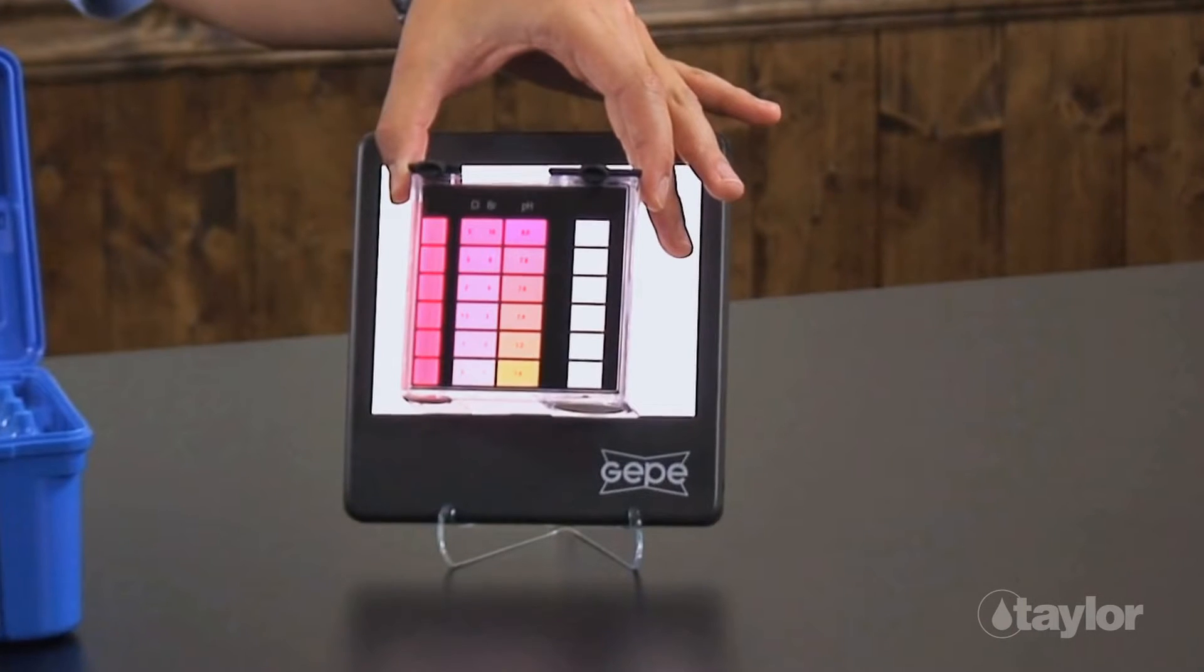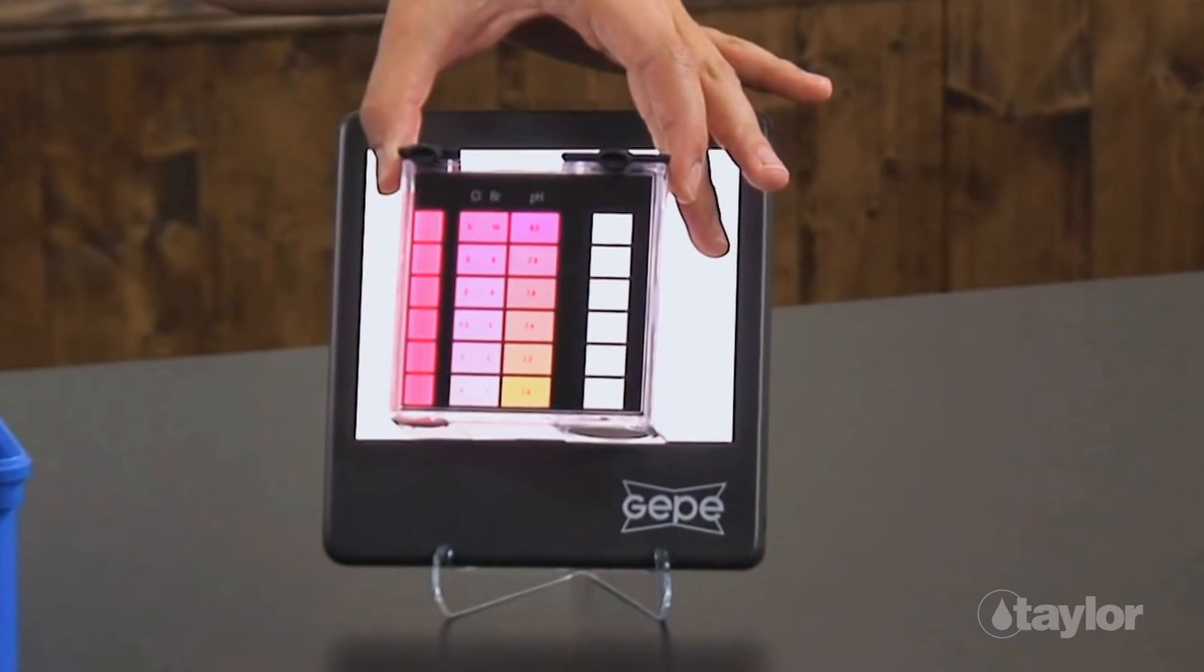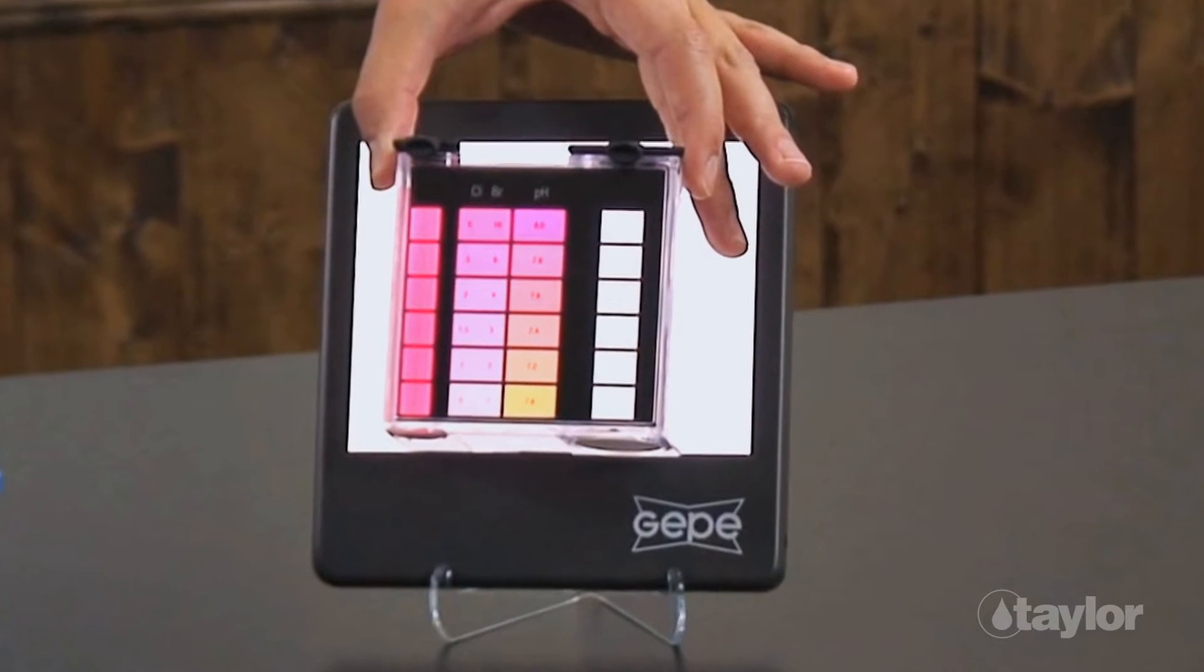When the color match appears to be 10 parts per million or darker, the sample should be diluted and a second test performed.